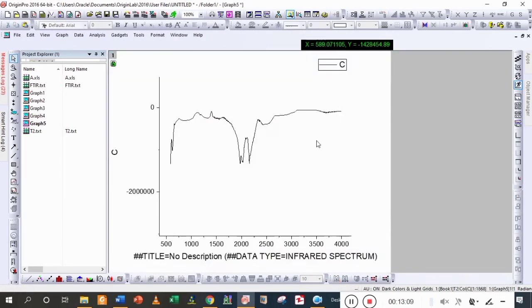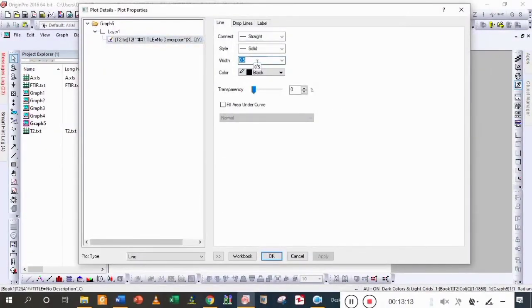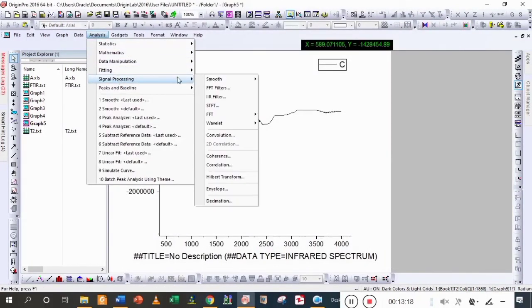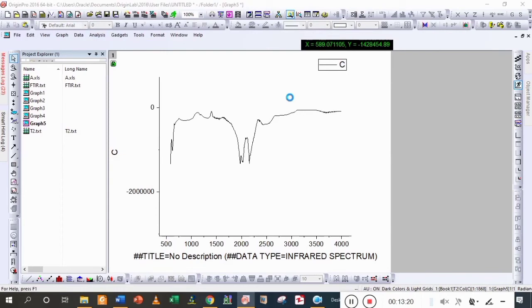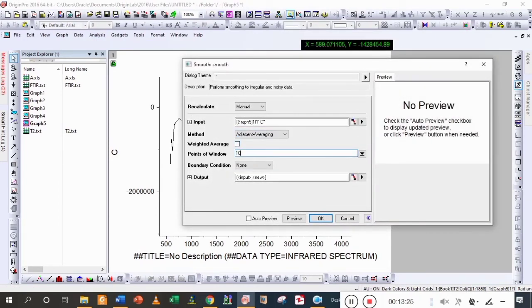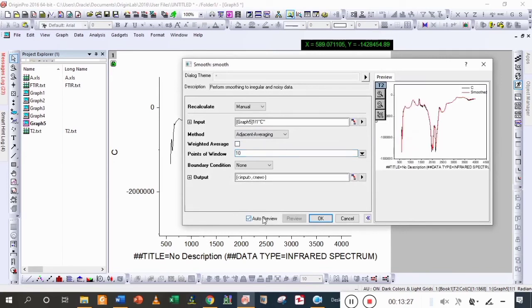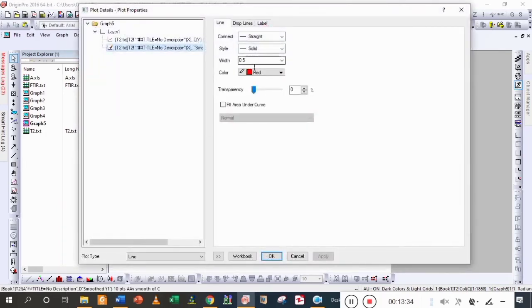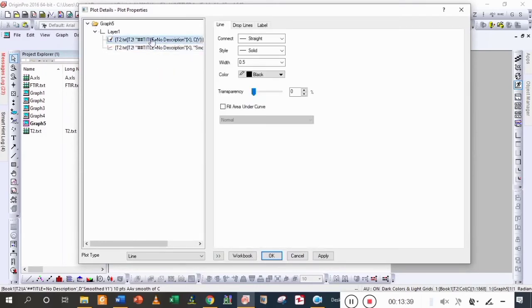Now the graph is in standard form. First we are going to smooth it and then apply the peak analyzer dialog box, and then make a standard FTIR graph. Apply the adjacent smooth — and now we have a smooth value. Firstly hide the previous data.